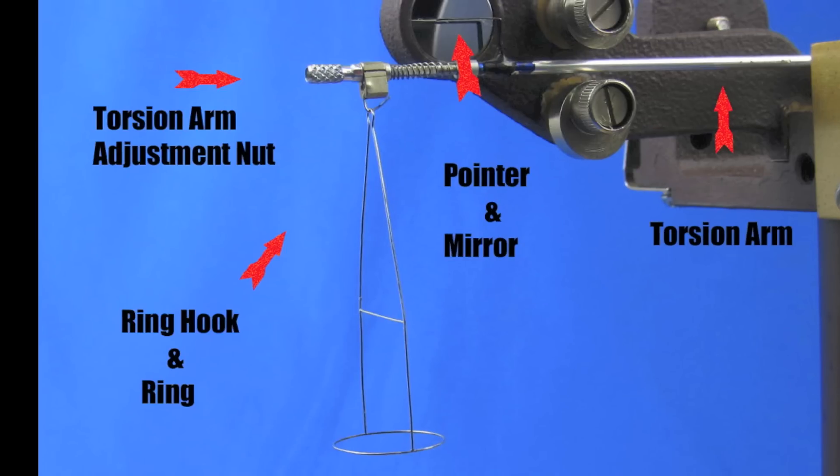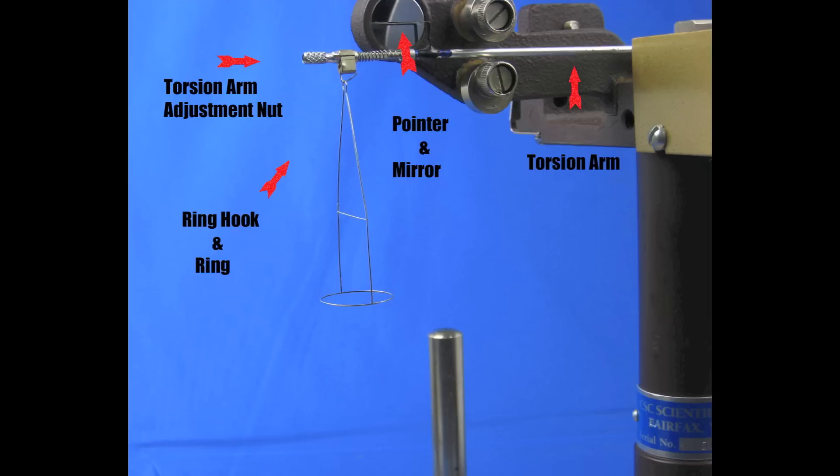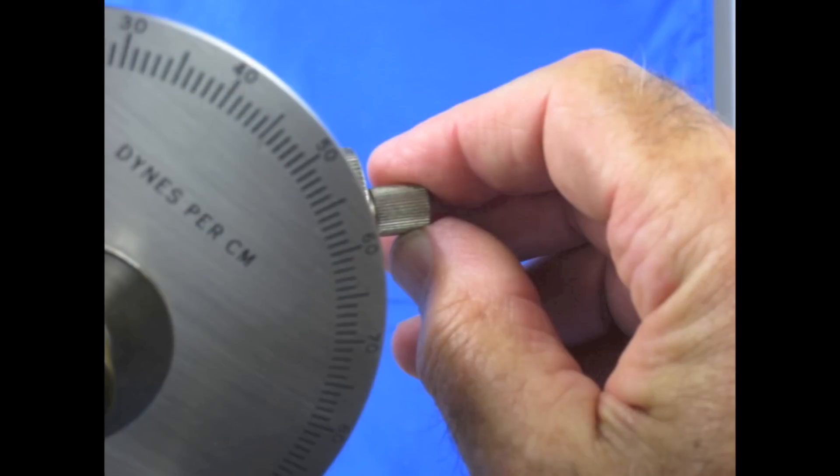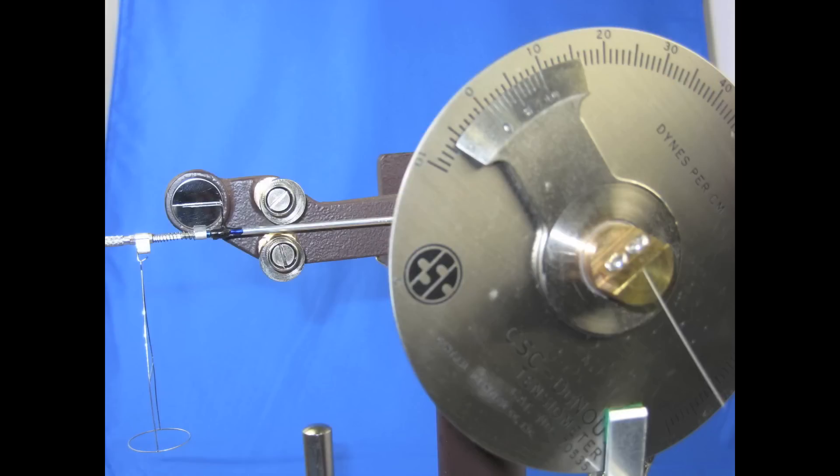The next step is to move the arm pointer back to the line by turning the adjustment knob clockwise until the arm pointer lines up with the mirror line. Next, loosen the dial clamp and turn the dial until the dial zero line matches the zero line on the vernier.